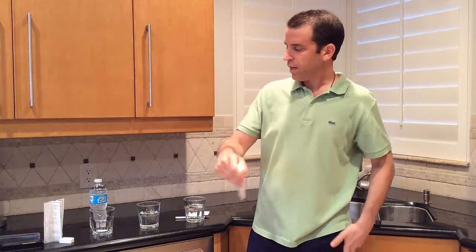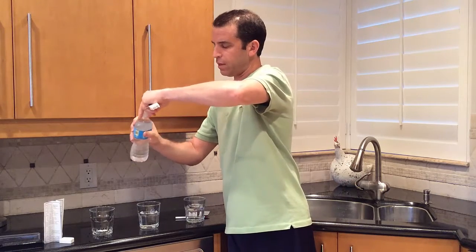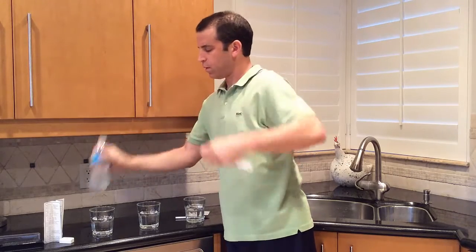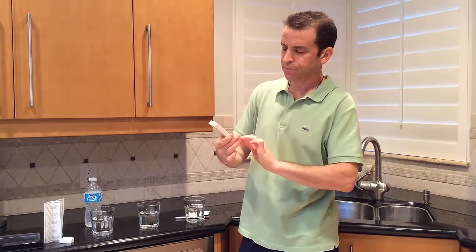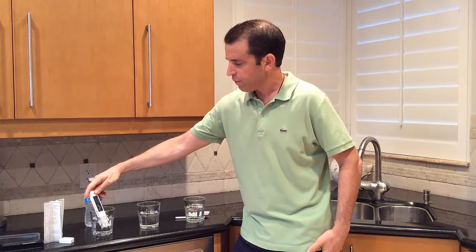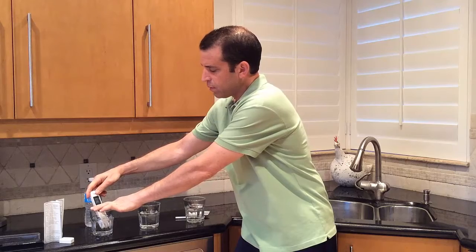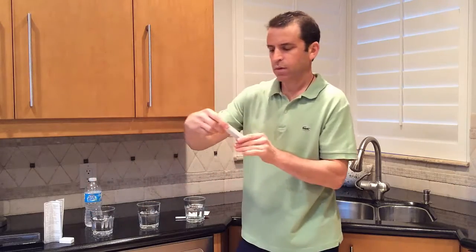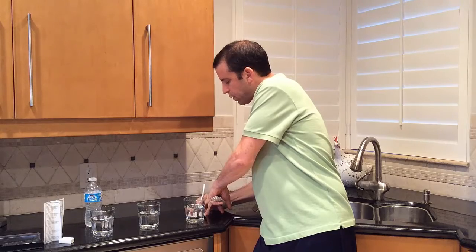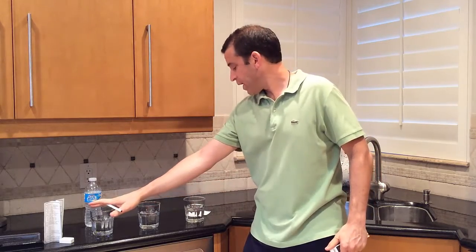The last test — I'll pour the Nestle Pure Life bottled water in here. Now let me press the hold button; it's back to zero. I'll immerse this and leave it there for a second. Let me press hold — 43. So the bottled water came back at 43. To recap: tap water 143, filtered water 139, and bottled water 43.